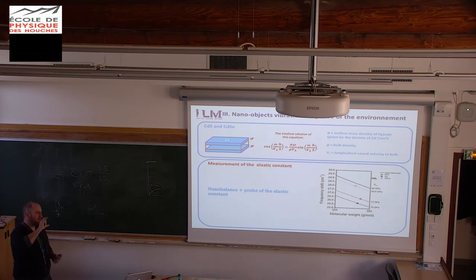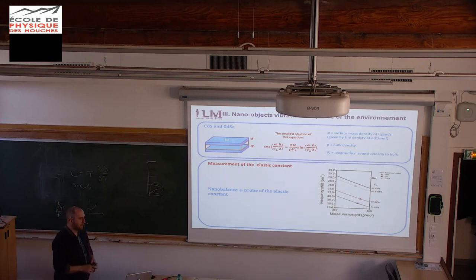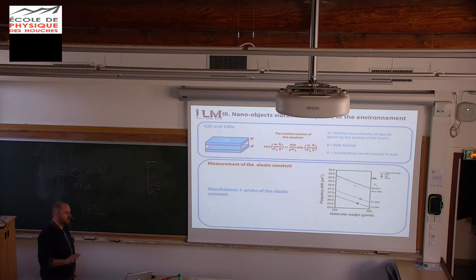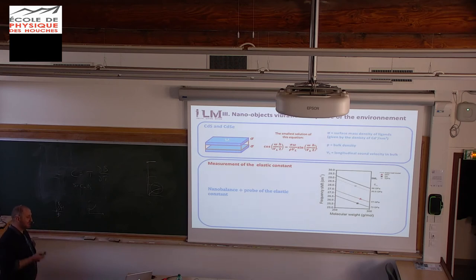It's a breathing mode. This is really the thickness. Probably yes, but we are not able to measure it. I don't know how to do that, for instance. But it's really three monolayers. I don't know. There is shear. It might be at higher frequency. We do not look at that, really. But I don't know. We always look at the most intense signal.